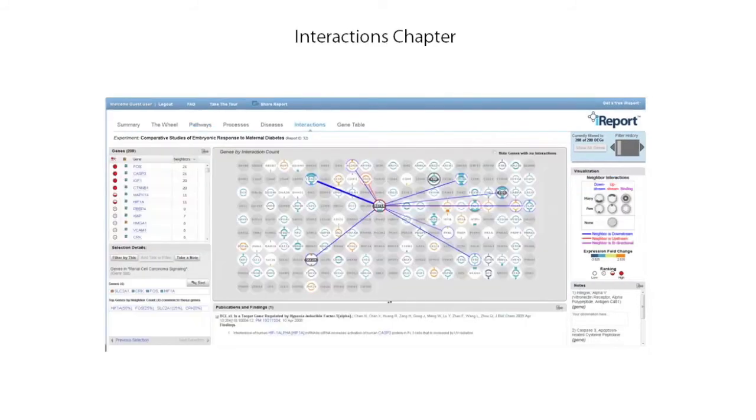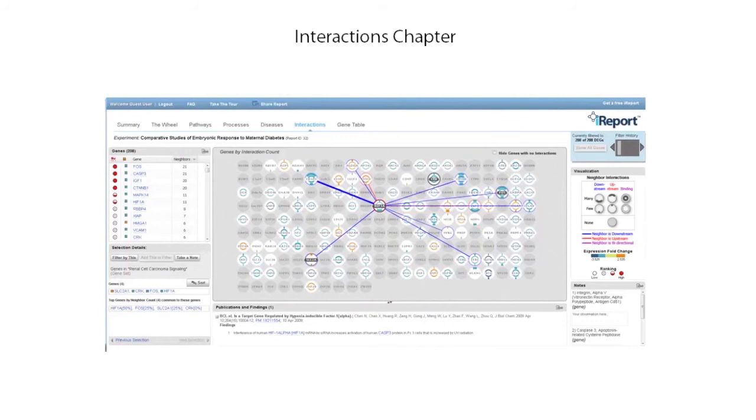In the interactions chapter, you can easily identify the most connected molecules, visualize upstream and downstream neighbors, and get information about the context of these interactions. Understanding the context in which your genes of interest interact and regulate each other's activity provides mechanistic insights about your experimental model and provides key genes to follow up on.